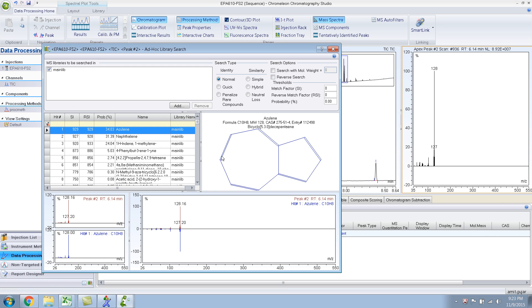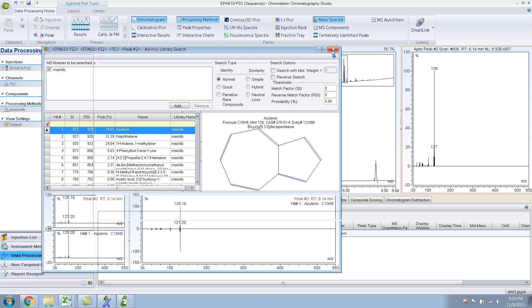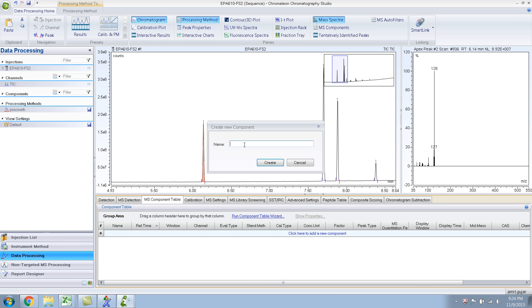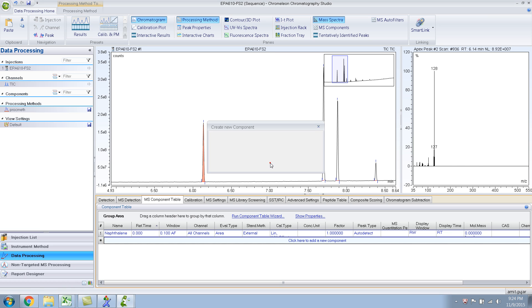So I know the mix contains naphthalene, even though it's the second hit. I guess azulene has a similar mass spectra like naphthalene. So I know this is naphthalene. So what you do is click here to add a new component and type in naphthalene. Okay, then you press create.